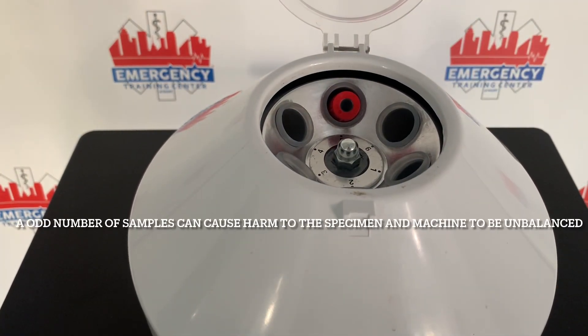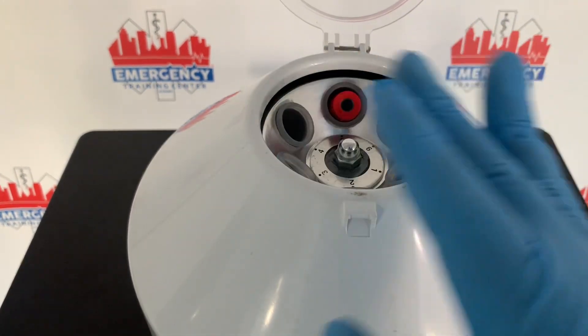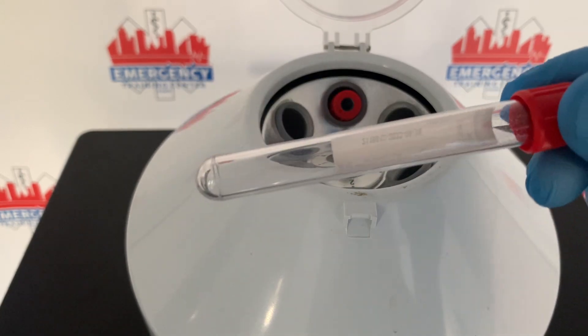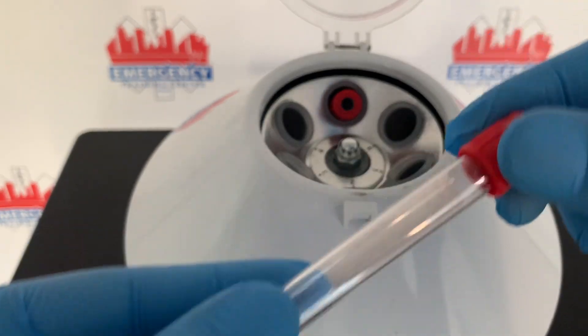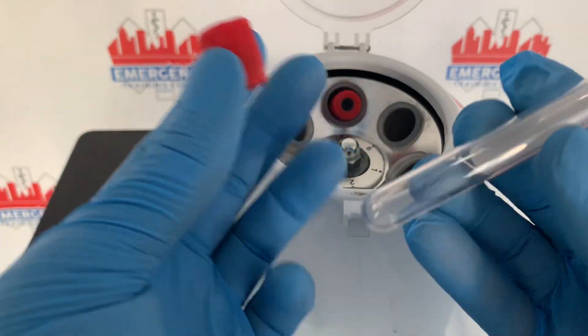You cannot have only one specimen, even if the doctor or nurse told you to draw the person's blood and only needed one tube. What you're going to do is improvise — take an empty tube, an ETS tube, which is typical practice at a lot of places.